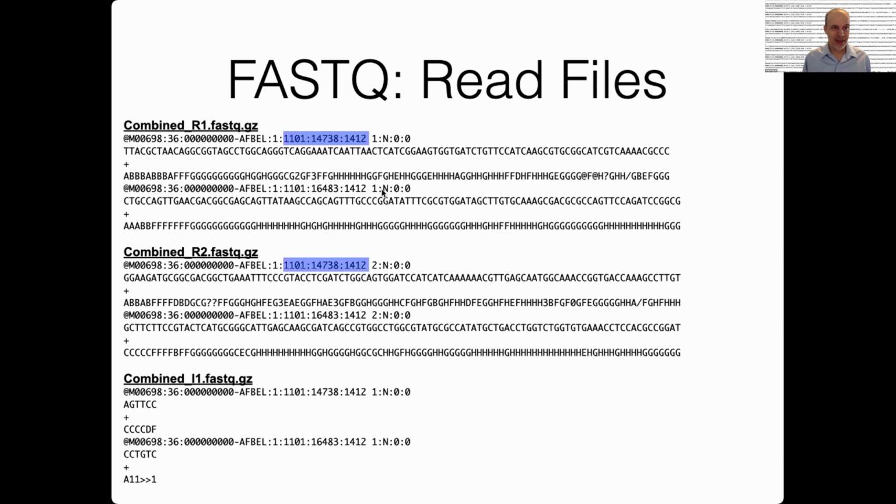You can see that if you look at the coordinates of these spots, they're all the same for those three. I'm giving you a snippet with just the top 2 reads in the file, and for this second read, the coordinates are all the same, right?